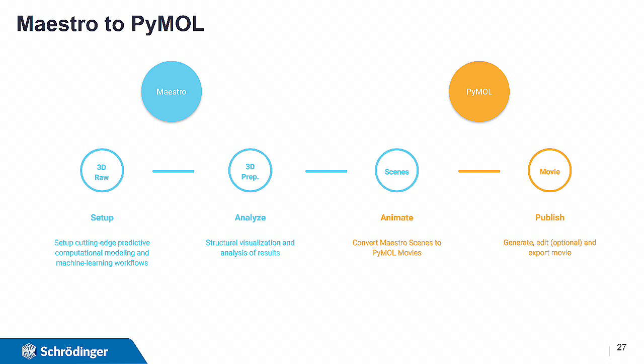Now, rather than save the results as an image for publication, they can save key milestones and data points as scenes, which they then pass over to PyMOL. PyMOL is then used to generate an animation or apply cool new presets, and then publish this as a movie.